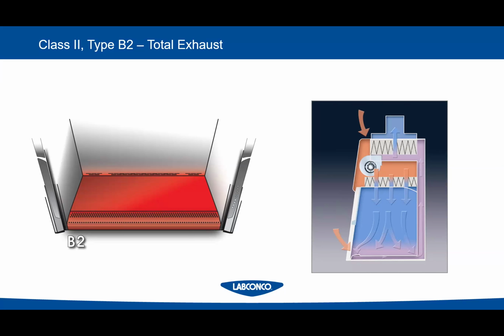The reason is one of the things we haven't talked about really: over time, these HEPA filters are going to load with dust and stuff. That means that blower is going to have to work harder. Static pressure is a lot higher. So if I have 4 cabinets on one system, most people prefer to use the one by the window where I can look outside. That one's going to load faster, right? What are the others going to do? They're all pulling the same volume of air. You're going to start getting alarms, all kinds of issues, where over time they're going to go out of balance.